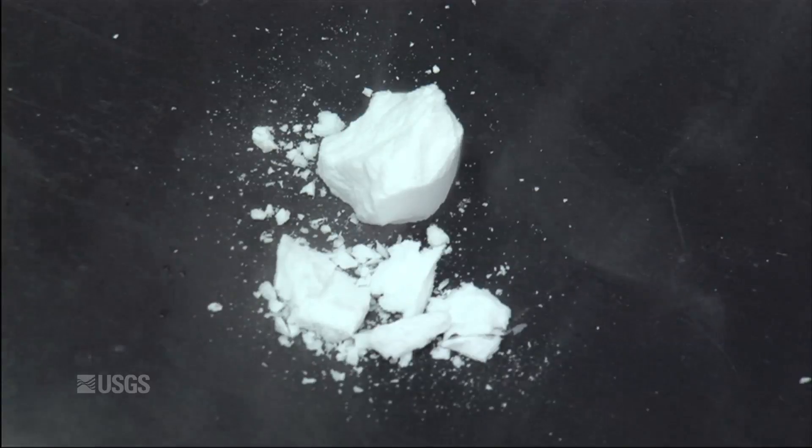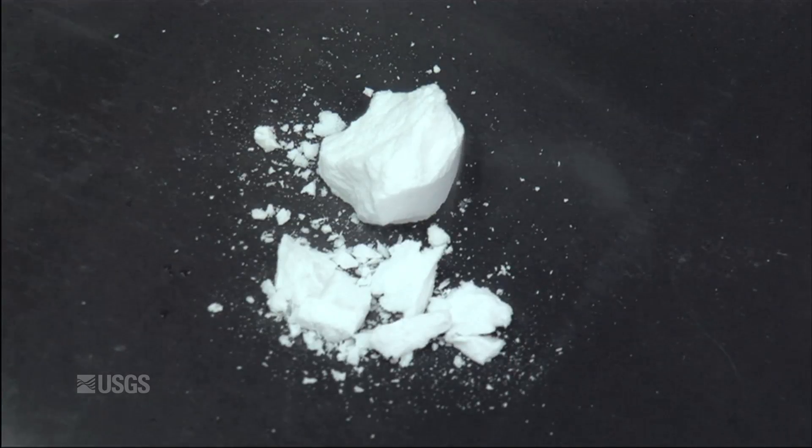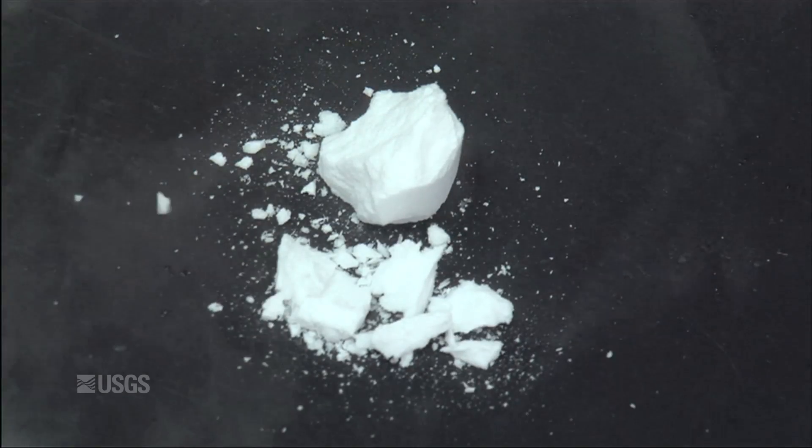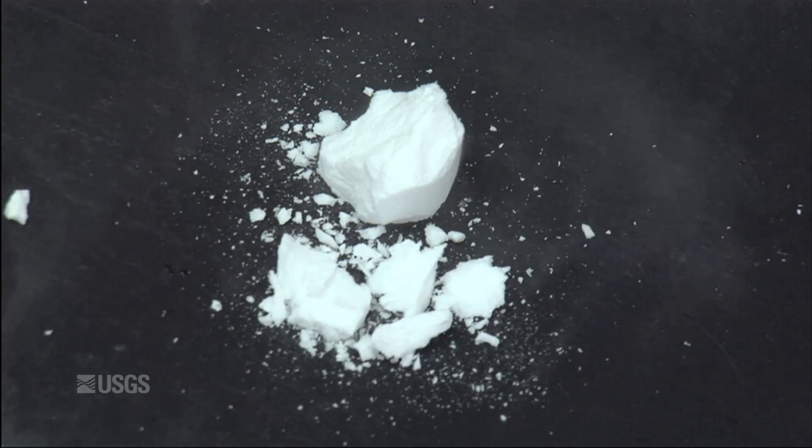Take a little piece off here, and as it warms up you'll begin to see it pop. It's reverting to ice plus gas, and then as the ice melts and continues to warm, it'll end up being water plus gas.